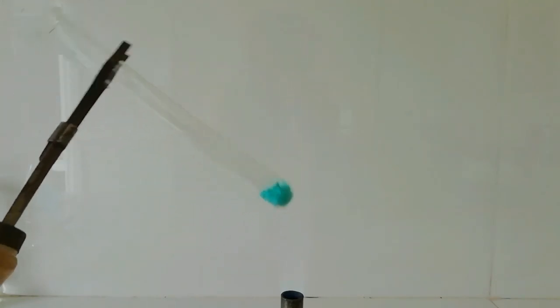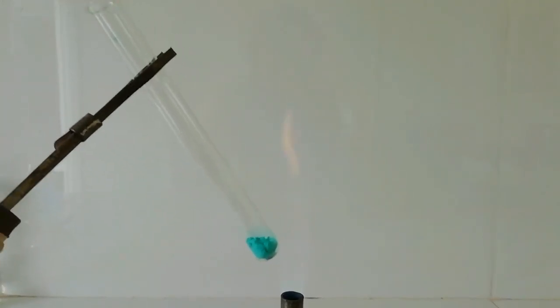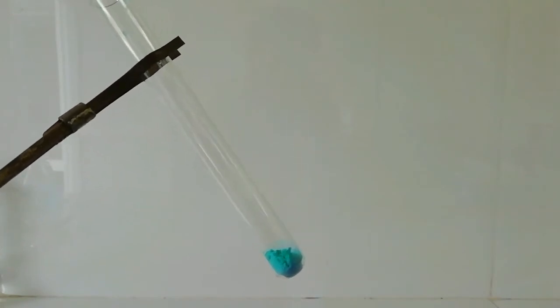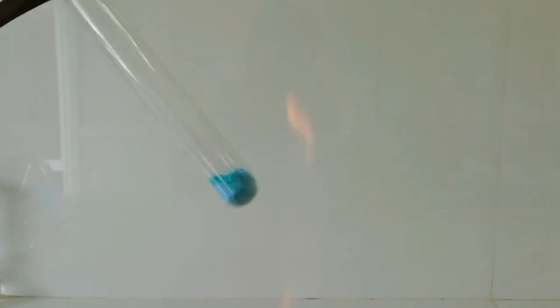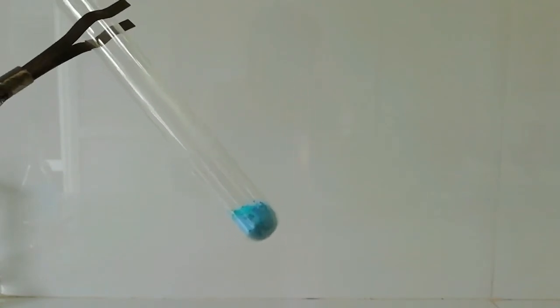In a test tube, I've taken about a few grams of copper citrate. Now we need to heat this copper citrate and decompose the product. You can see when I heat the test tube, the green color turns to blue.